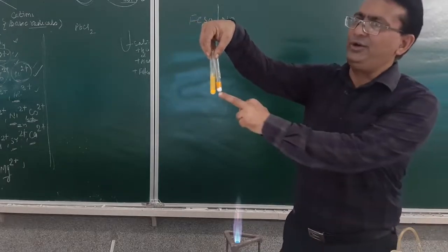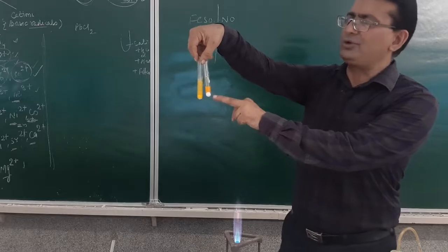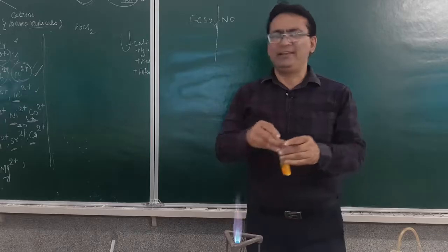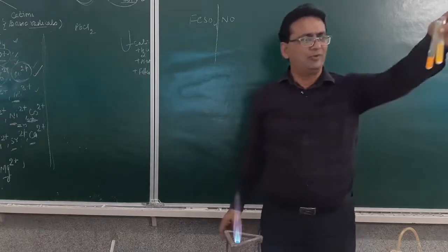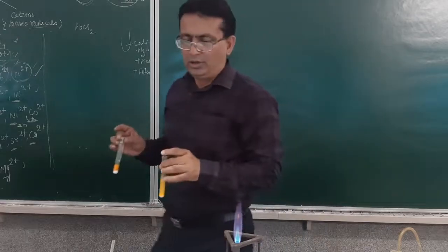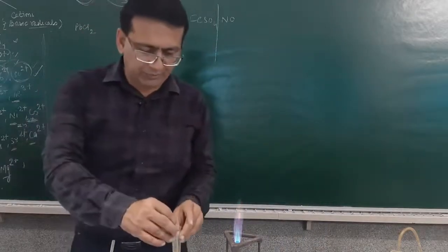This is a mustard yellow and this is similar to the uniform of a policeman, a khaki color. You may see this. So these will be two distinctions. This confirms the presence of a lead ion. Is it clear, students?